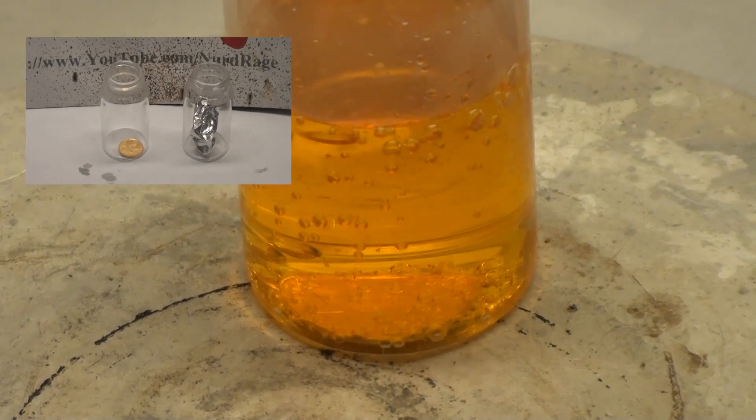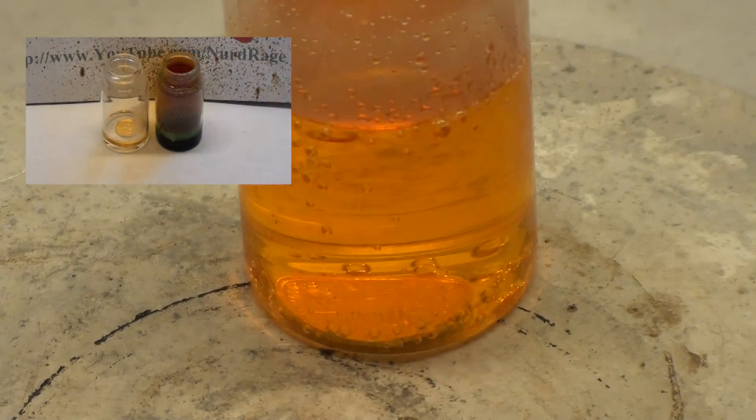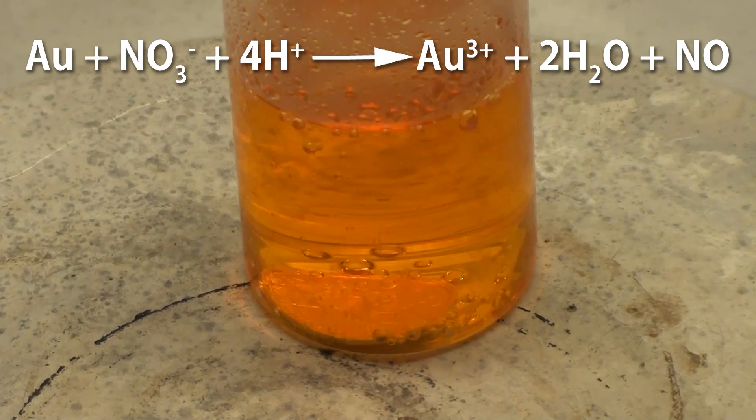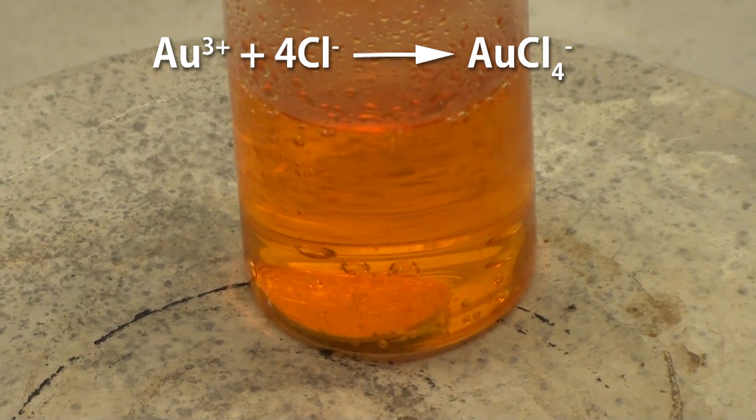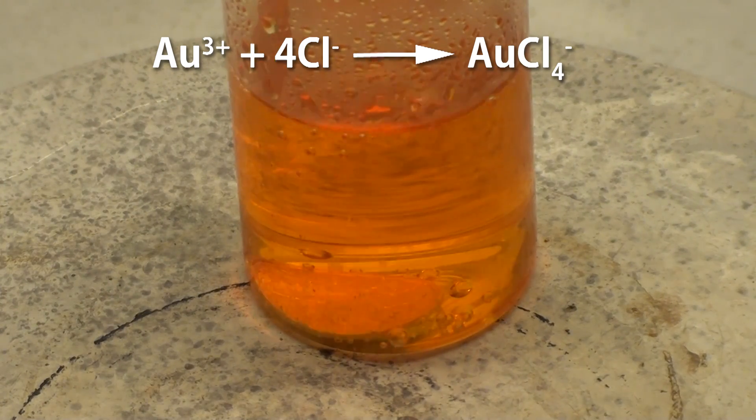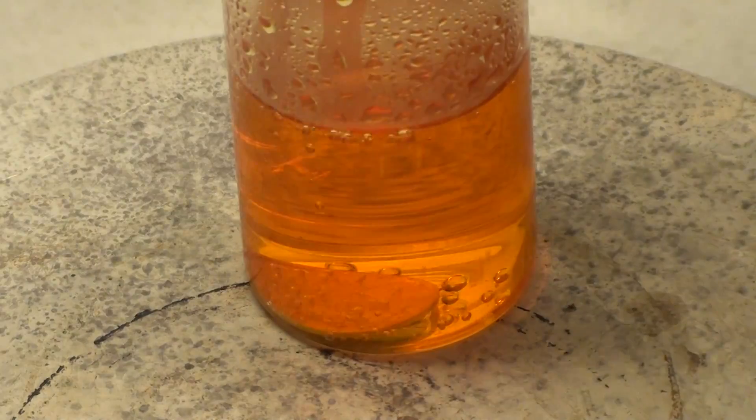We showed in a previous video that gold will not dissolve in either hydrochloric acid or nitric acid alone. What's happening here is that the nitric acid is first oxidizing the surface of the gold. Then the chloride ions in the hydrochloric acid react with the gold ions to form a complex ion that dissolves away into solution. The nitric acid then further oxidizes the surface and the process repeats.